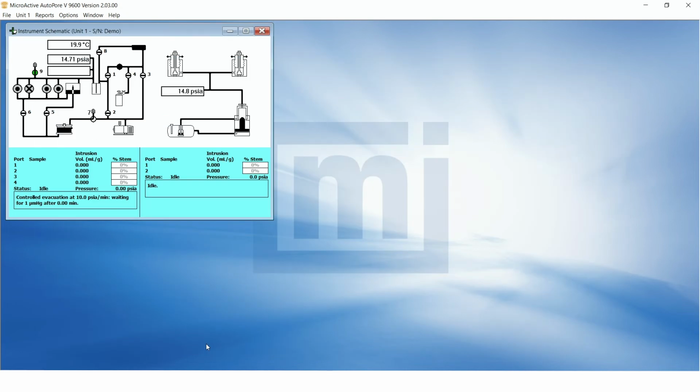Okay, some materials compress under the influence of high pressures used in mercury intrusion analysis, and there are no pores being filled at those pressures. The reduction in sample size can appear as intrusion into small pores. Mercury must replace the volume that the compressed sample no longer occupies. This mercury appears to be intruding into very small pores since it's taking place at very high pressures, leading to erroneous results. If we know that only compression is occurring, we can use the software to correct for it.